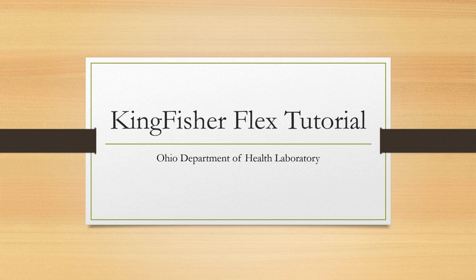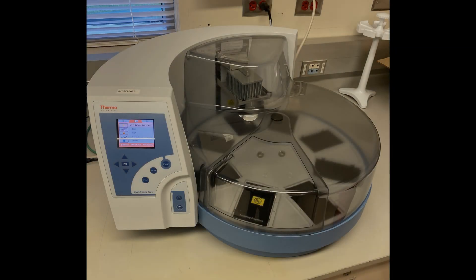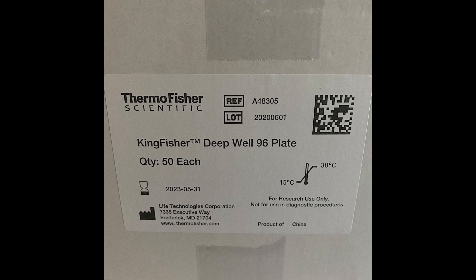This is a brief tutorial on the use of the KingFisher Flex system for the extraction of SARS-CoV-2 RNA. The KingFisher Flex is a benchtop automated extraction instrument that can be set up for 24 or 96 samples. Based on sample volume, our lab uses the deep well 96 plate option.